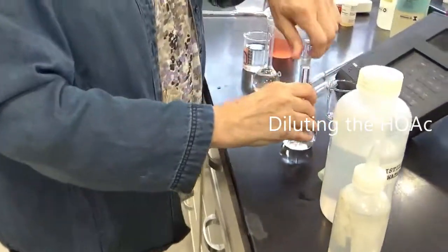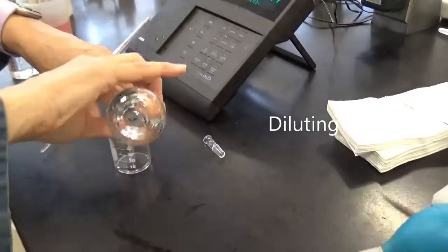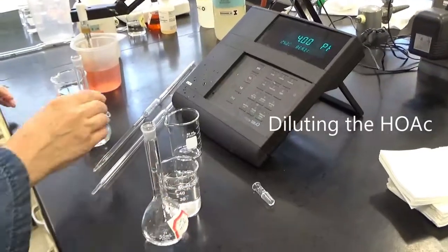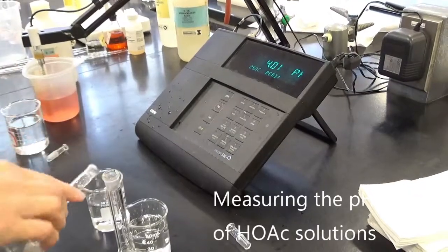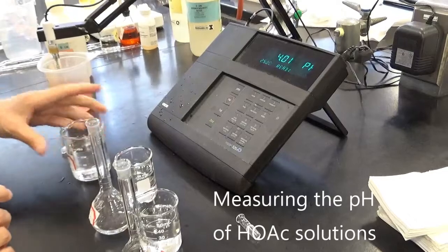And I'm going to pour each of these into a beaker. So that's the second dilution. This is the first dilution. And this is the original, okay?